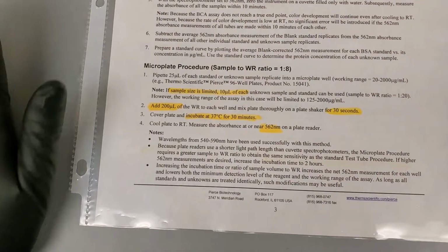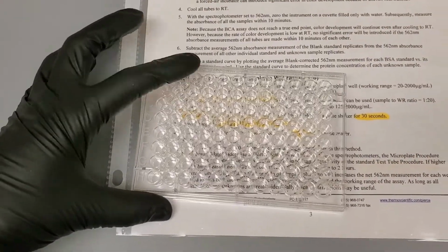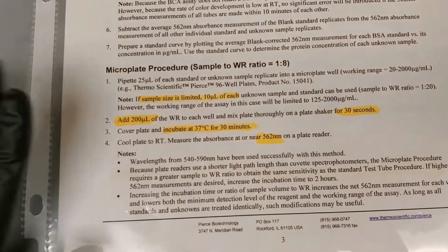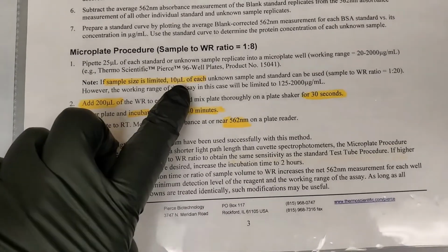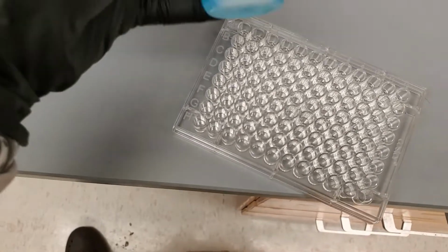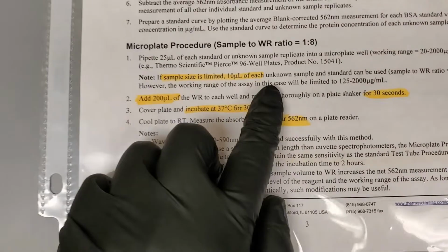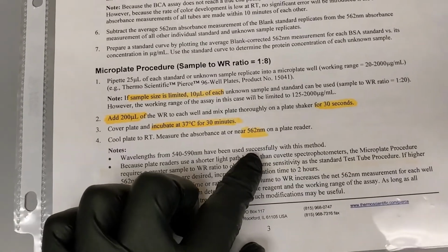For my particular assay, I use the 96 well microplate, and I load in triplicates, so my ladder in triplicates and my samples in triplicates. And so I have here the instructions for my microplate procedure that I use. So really straightforward. I use 10 microliters of my samples that I load into each well of my 96 well plate, and then of the mixture with the protein assay reagent A and B, I will load 200 microliters of that to my 10 microliters of sample, incubate for 30 minutes at 37, and then read at 562 nanometers.